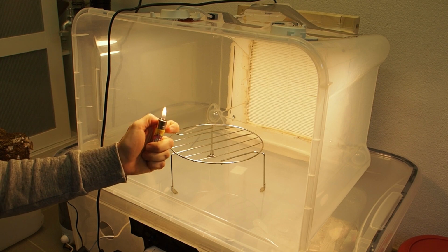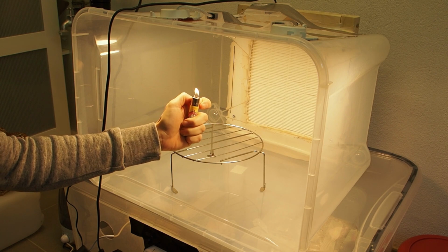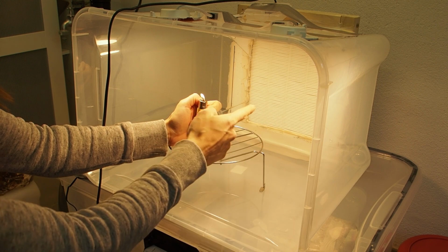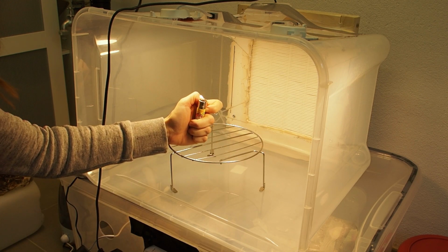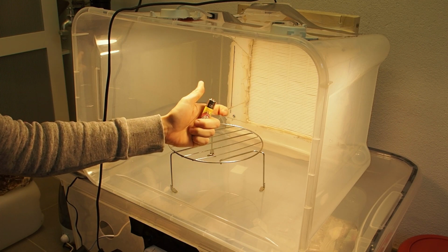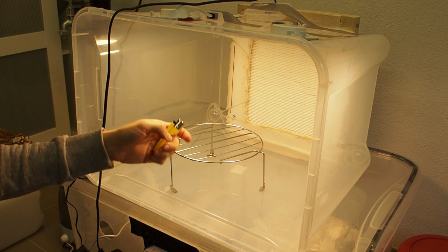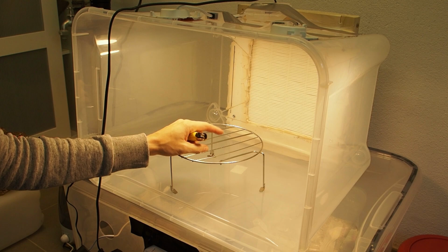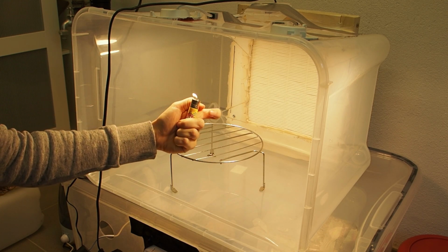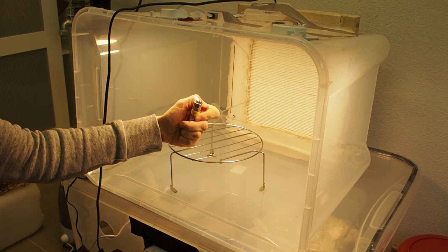Okay, finally my laminar flow hood is done, and as you can see by the flame, we got some air traveling from the filter to here towards me. The flame could be bent stronger, so the airflow could be better, so I might get two more ventilators on top of the other ones to make the airflow stronger, but right now, as you can see, the flame is coming towards me, so it should be okay.